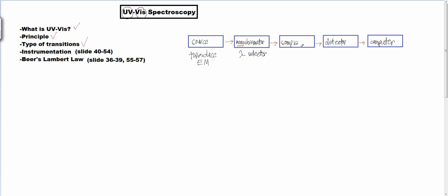Okay, so this is a sample. So that means this is a sample holder. Kita boleh kata this is the place that I have to put the sample. Ataupun we need something, right? To hold our sample, for example, right? It's quite easy to understand.